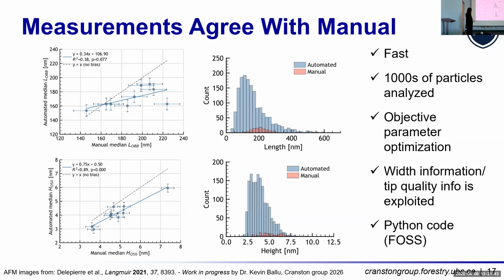So this is something that a current postdoc in my group is working on, Dr. Kevin Balu. And for people that are interested in image analysis, we'd love to chat with you more. And he'd be really happy to share the code, which is in Python, because he doesn't want to do anything that's stuck with subscription-based MATLAB.